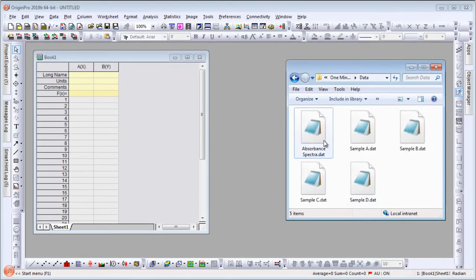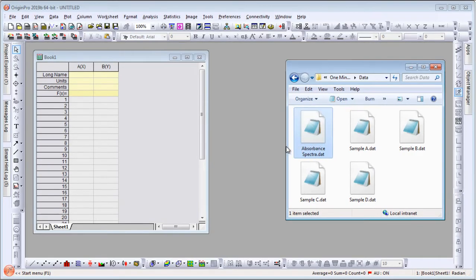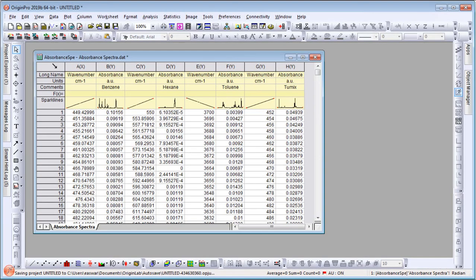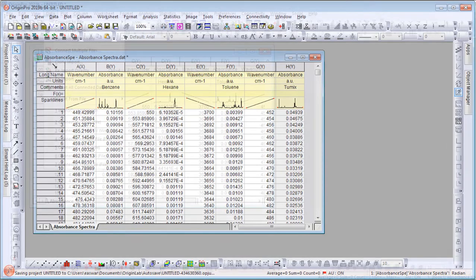There are many ways to bring your data into Origin. The easiest is to simply drag and drop a file into the workspace to get started.